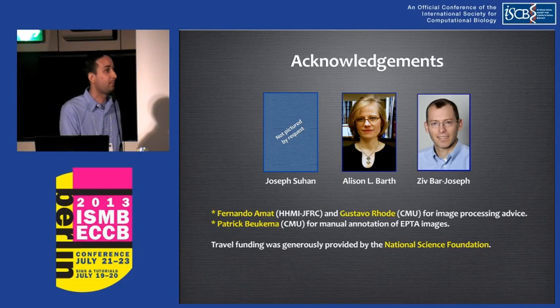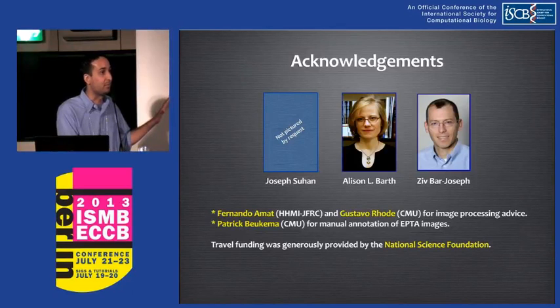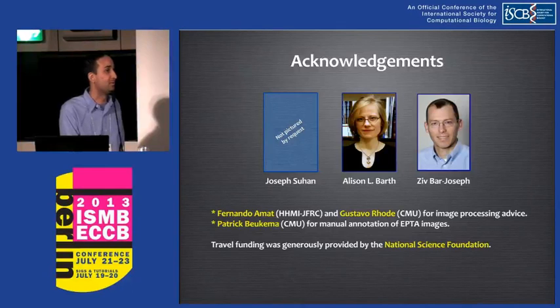What did you use when you tried to do this kind of evaluation? Which kind of algorithm? We also tried a segmentation, similar to what we did here: a first pass segmentation to generate candidates, and then look at different properties of each candidate to see which are most likely synapse lookalikes. The template matching that we compared against is also very much like that, where you have some templates and for each candidate you see whether it looks like any of these templates, and it just wasn't as robust as we thought.